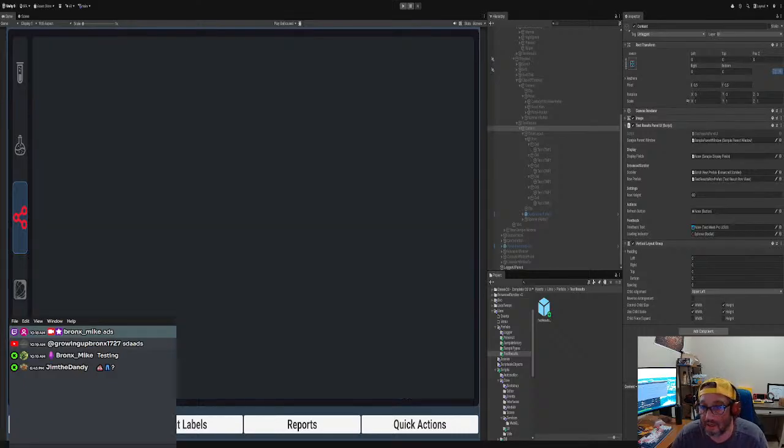Then we load the data. On show results, we load the data, fix the scroller horizontally. That's if you want to. You don't have to if you don't want to, but some people want to go to the last row or the first row. So you can set that to the middle row, whichever one, wherever you want. Okay, load and display data, we did that.